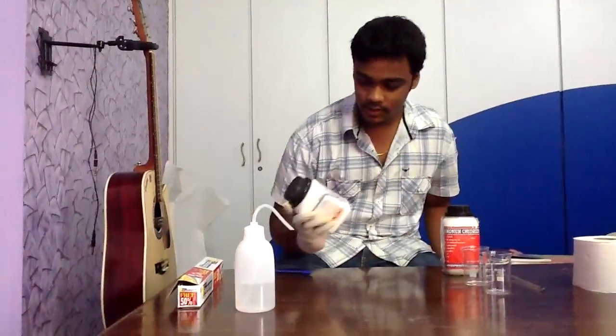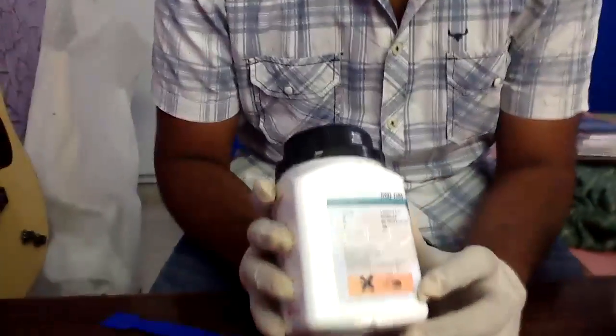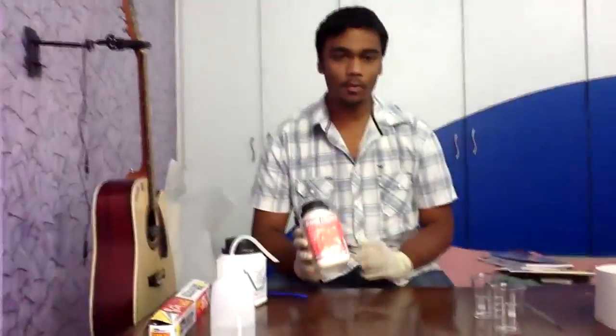Hi friends, today I am going to demonstrate an experiment between two reagents. It's barium hydroxide — it is a corrosive substance and also an irritant, so I have got some protection. And the other reagent is ammonium chloride.